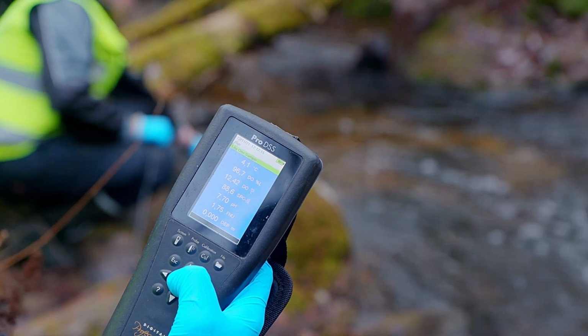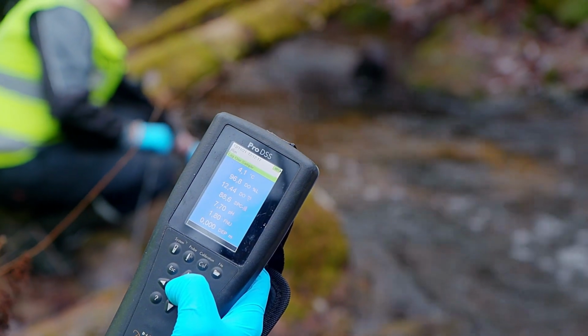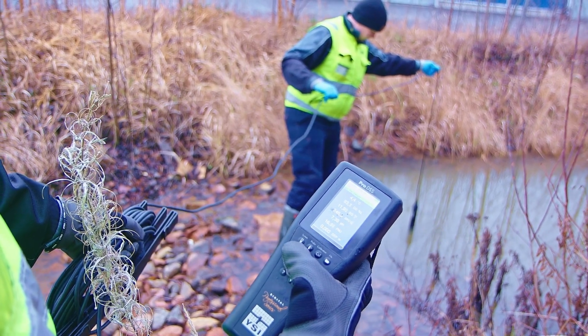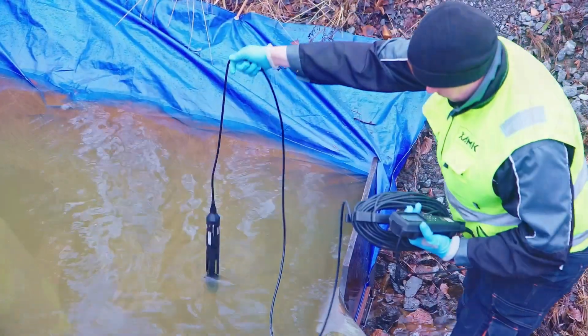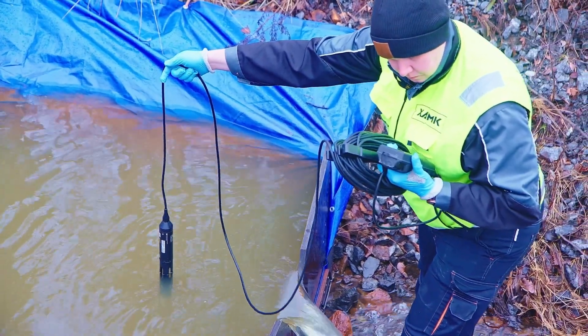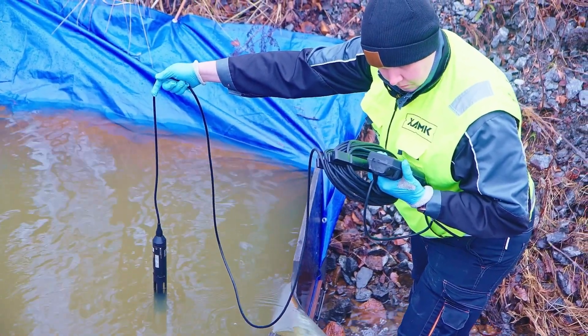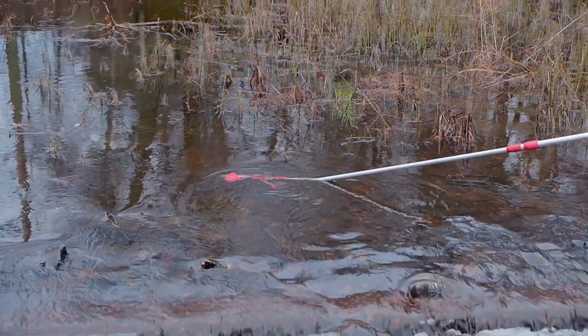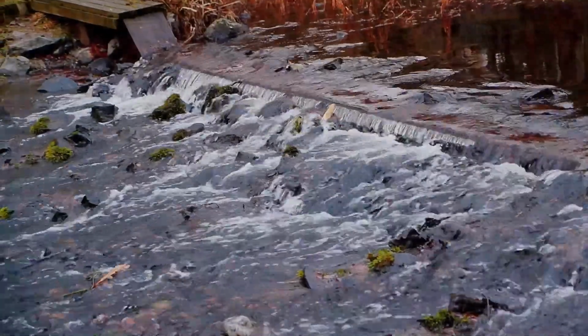Meters, on the other hand, provide many observations, but only concerning general water quality parameters. Meters support sampling with the number of observations, whereas sampling supports meters with the quality and accuracy of analysis. This enables the combination of quantity and quality and the formation of a comprehensive overall picture with observations.